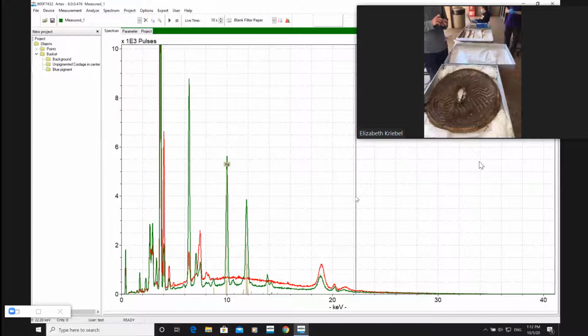That's purely extracurricular reading. And then Anonymous just asked, do the natural cinnabar and synthetic mercuric sulfide degrade in more or less the same way? That's a really good question. The thing is, what's degrading is the mercury sulfide bond. So the presence or absence of contaminants like silicates and all that, I don't think it's going to impact it too much. But I don't know. It might be having stuff that can defray the light a little bit at that near quantum level, which would help preserve it a little longer. But it's the mercury sulfide bond in particular that's vulnerable, and that's going to be the same in both.